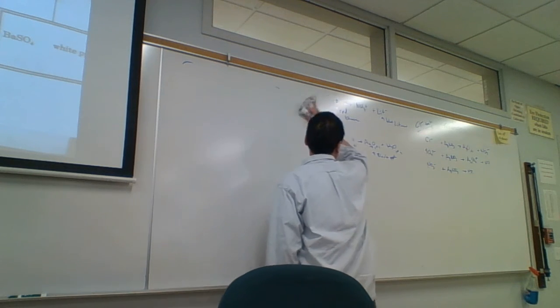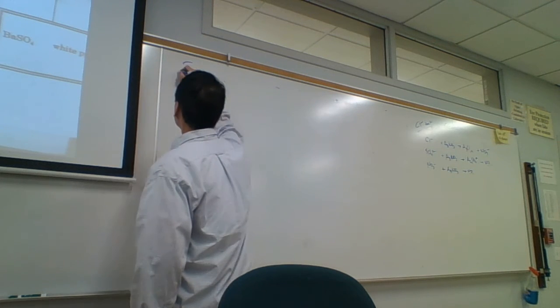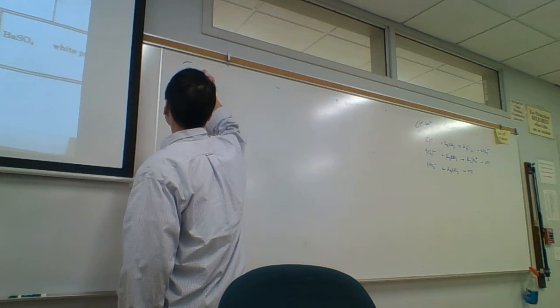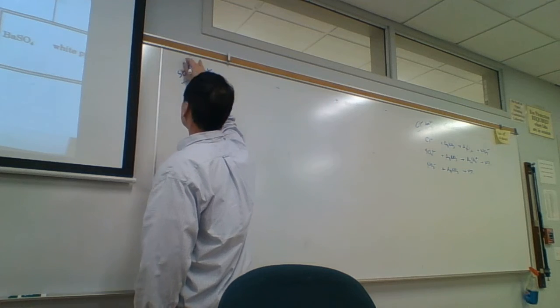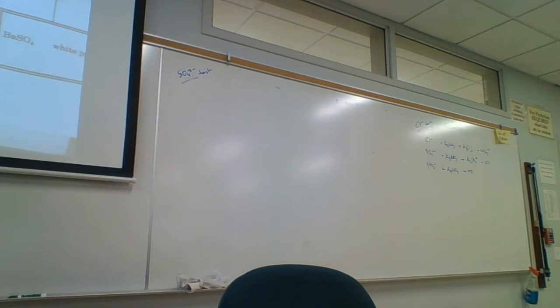Okay, the sulfate test, well, we have 3 possible anions. Now, the known solutions, you have a separate known for the cation and a separate known for the anion. The anion known solution is in the back there. The cation known solution you get from the stockroom here.